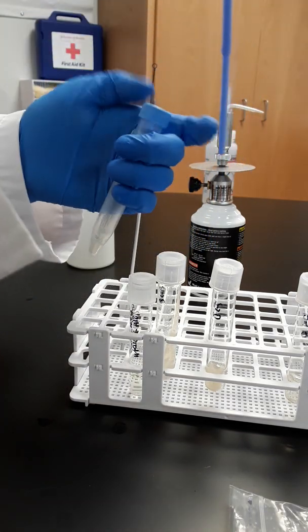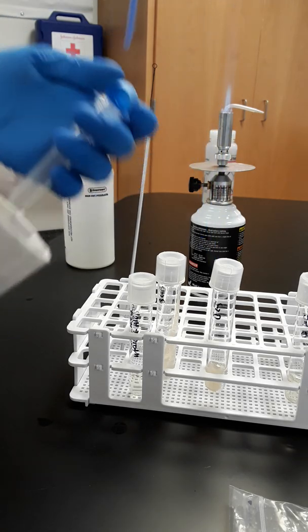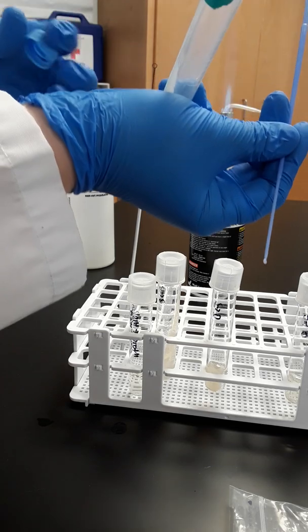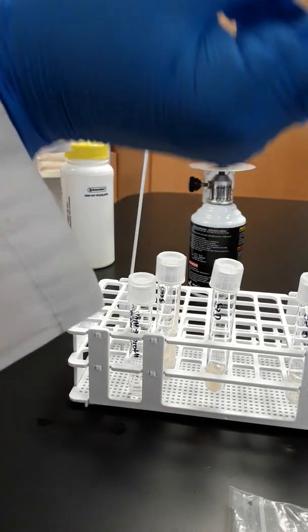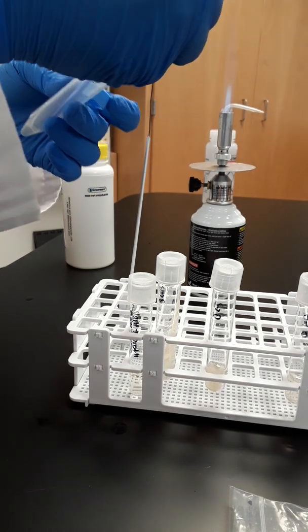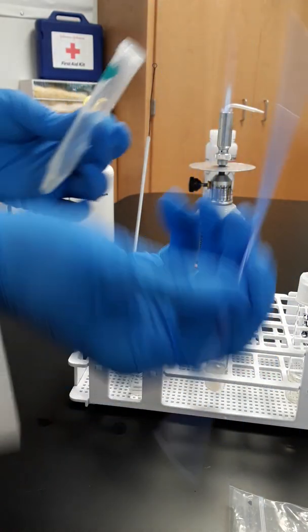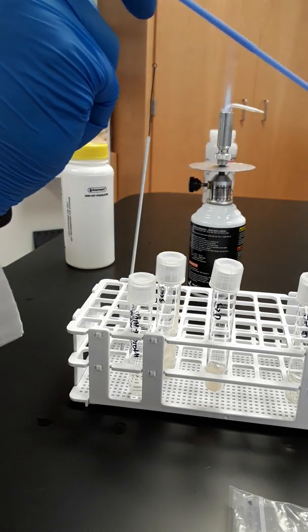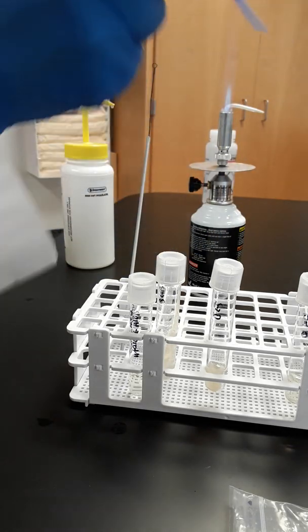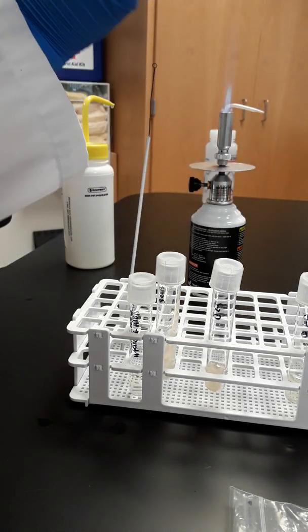Okay, then same idea. We don't have to sterilize this because it's already sterile. We're going to open our tube and we're going to flame, flame. And then we're going to touch it to one cell. Touch, touch, touch. Make sure. Oh, there, that's it. Now the cell is on our loop. Cap this back up. Oops, should have flamed it first. Flame, flame. Cap that up. Notice I'm not flaming very long at all.